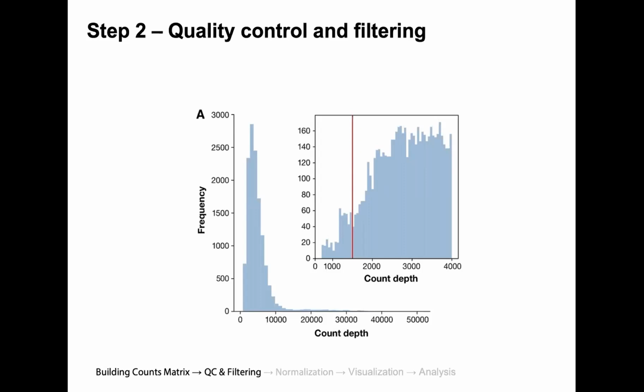But I think, just keep in mind that if you have some reason to think that there is a population of cells with twice the library size of some others, go into the data set, characterize them, and always lean on the side of removing data only after you've looked at it. You might see, oh, it's actually the same set of genes that are expressed just twice as much, or, oh, interesting, there are some markers that I know should not be seen in the same cell, like B cell and T cell markers, but I actually see them together here. Those are cells I should remove. So those, I think, are really good indications that those might be doublets.